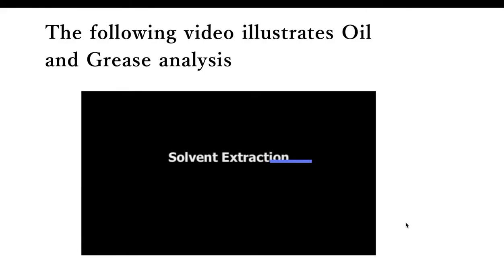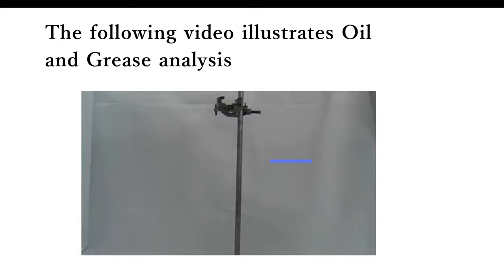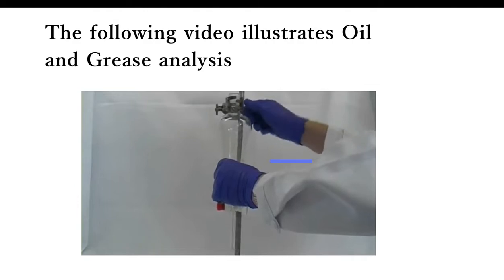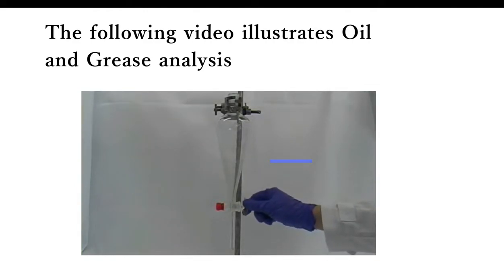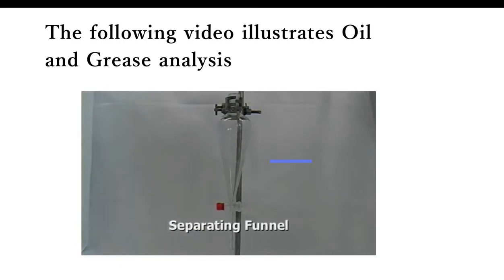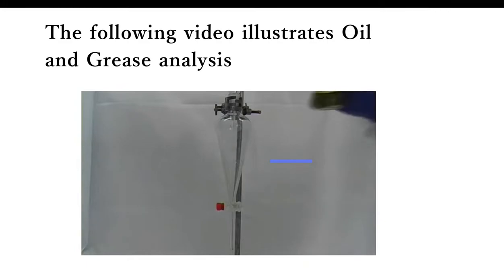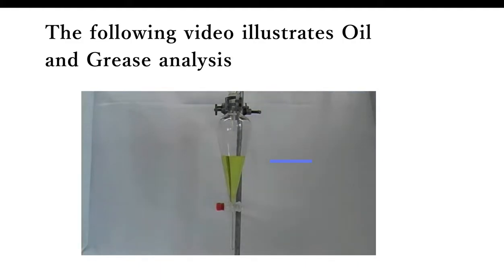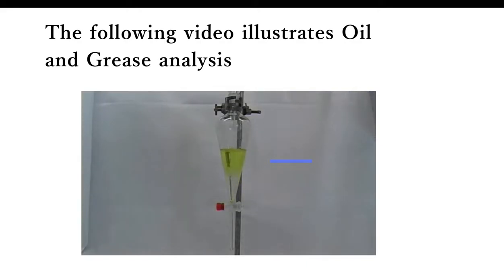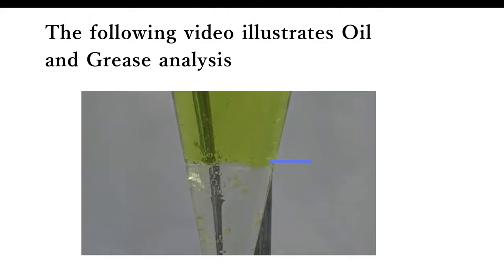Welcome to our solvent extraction video. In this video I will demonstrate how to use a separatory funnel to separate two immiscible solvents. First, clamp the separatory funnel firmly into a retort stand and make sure the tap at the bottom is closed so as not to lose any solvents. You may want to use a funnel to fill the separatory funnel. We first add our organic phase, then our aqueous phase, which is used for the extraction of any solute we don't want in our organic phase. You can see the two layers separated by the interface.